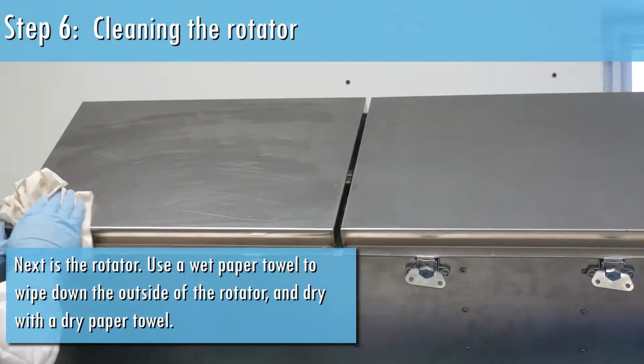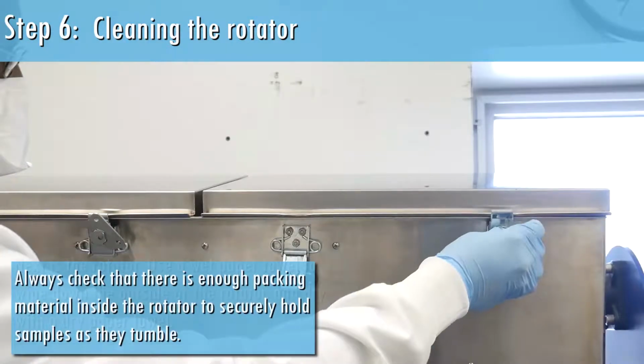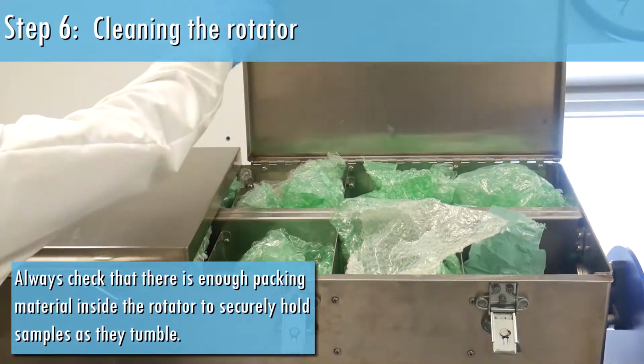Next is the rotator. Use a wet paper towel to wipe down the outside of the rotator and dry with a dry paper towel. Always check that there is enough packaging material inside the rotator to securely hold samples as they tumble.